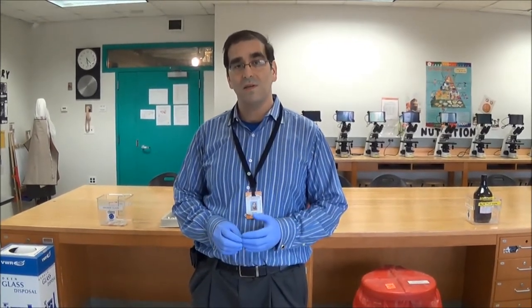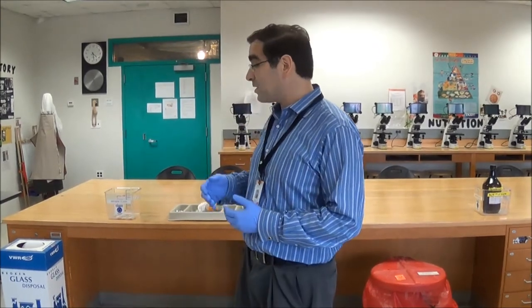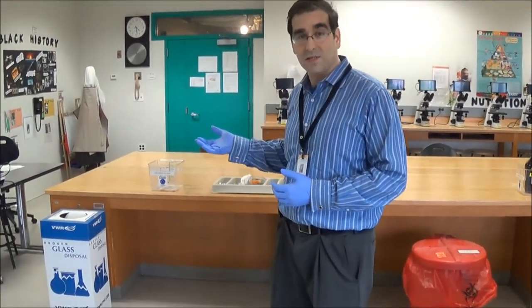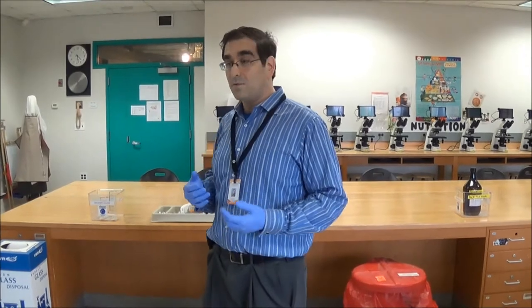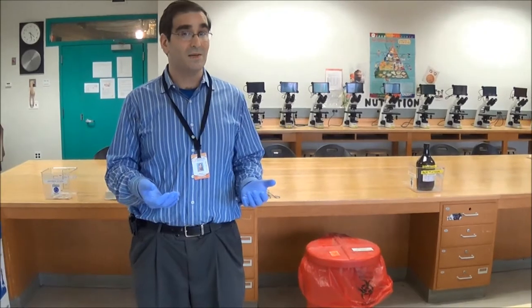I'd like to take this opportunity to go over the various types of waste containers you're going to find in the lab. This is important not only for your safety but for the safety of the staff that works in the laboratory and the waste people that come to pick things up. For instance, you wouldn't want to put any liquid waste inside one of our glass or sharps waste containers, and vice versa. I'll take a minute to go over the different categories and types of material you're going to put into the containers.